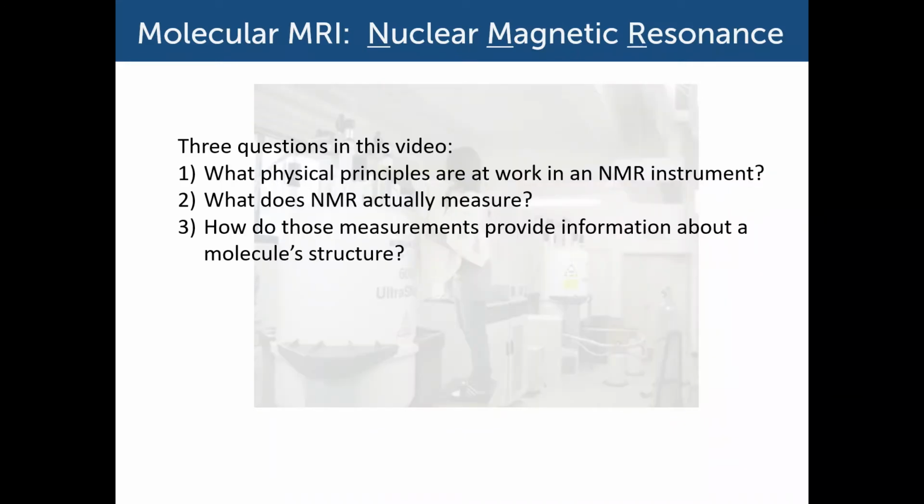So there's basically 3 questions we want to answer in this video about NMR. What types of physical principles are actually working in an NMR instrument?